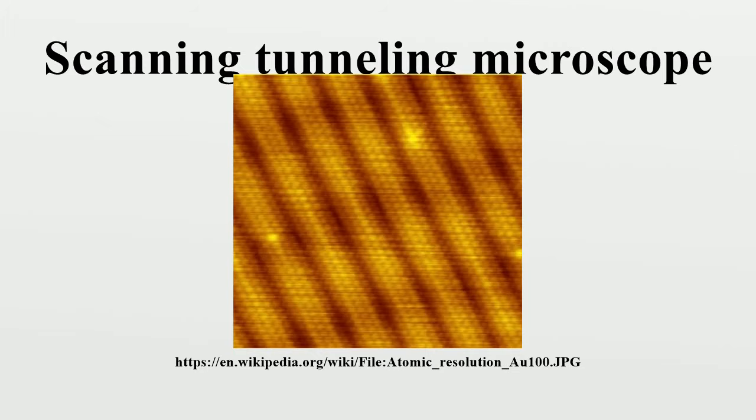The STM can be used not only in ultra-high vacuum but also in air, water, and various other liquid or gas ambients, and at temperatures ranging from near 0 Kelvin to a few hundred degrees Celsius. The STM is based on the concept of quantum tunneling. When a conducting tip is brought very near to the surface to be examined, a bias applied between the two can allow electrons to tunnel through the vacuum between them.